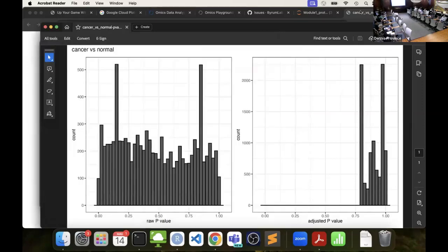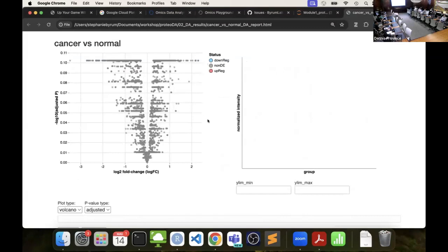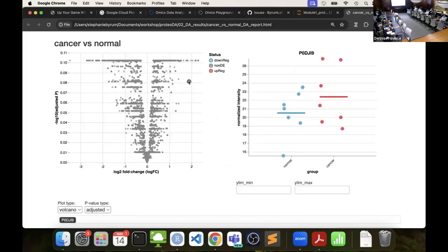All right. So in your plot, and you would actually get one of these with the IDEA logo and everything from our version. I didn't want to give everybody an IDEA logo on your own version. So the logo's removed. But you click on the dot. And so this is the protein that's going to be on the upregulated side. If it were significant, it would be up in the cancer group compared to the normal.